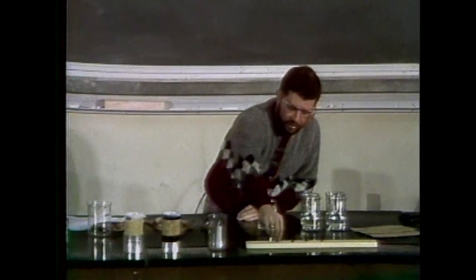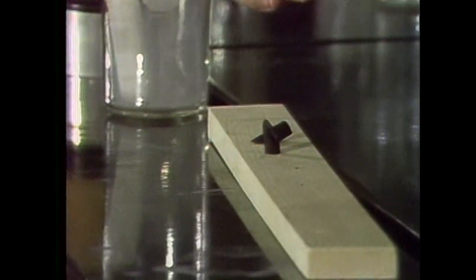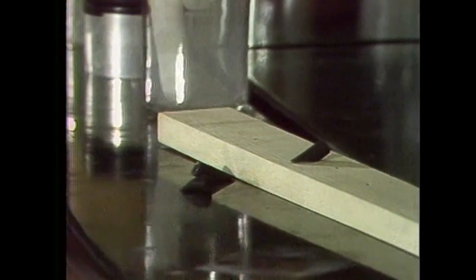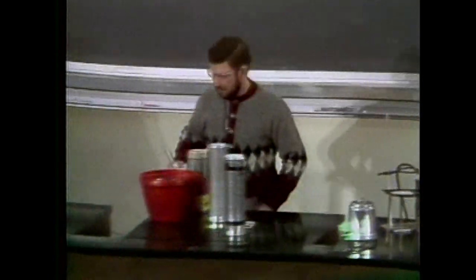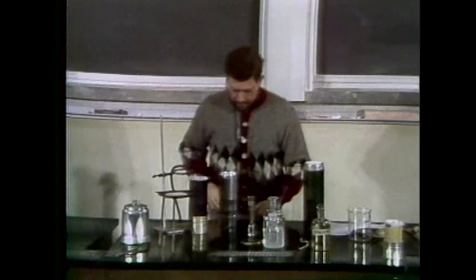And you see our rubber spikes here. There you go. Whoops, they're coming out. If I try to drive them in now, of course I can't do that. Okay, we'll get rid of this here and let's see what's happening with the methane here.